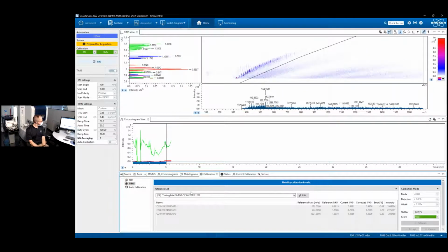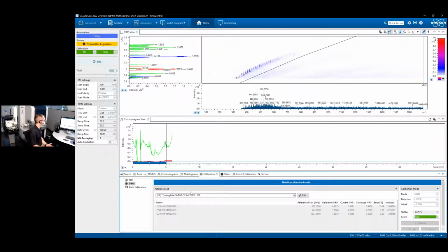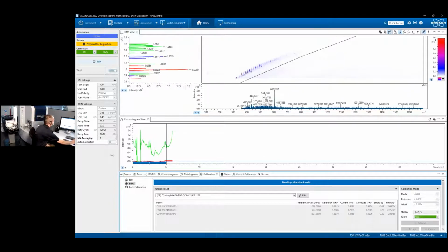Yep. Okay. There's a slew of questions now suddenly descended on me, and they keep changing the order in which they're showing up. So apologies for that, but I guess that's good. You'll see this in real time, actually.